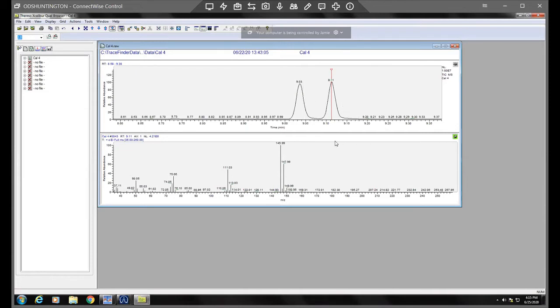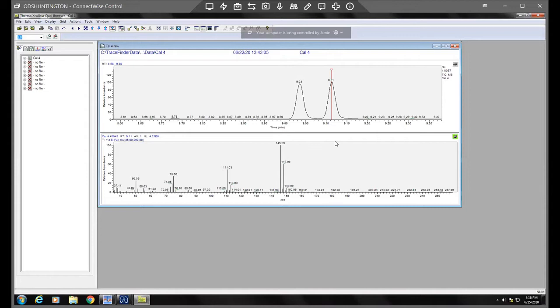So in order to search the library, the NIST library has thousands of known compounds and they'll kind of do like a probability based on those masses of what matches.